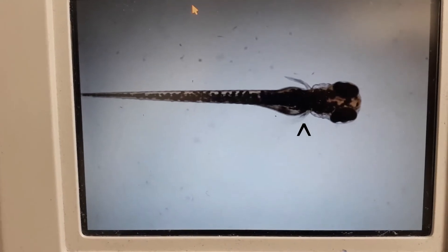So this is the eye. This is the fin. And this is the tail. It doesn't really look like an adult fish, does it?